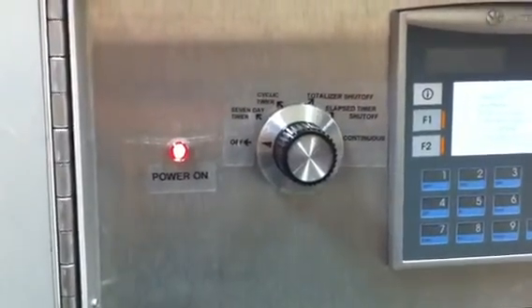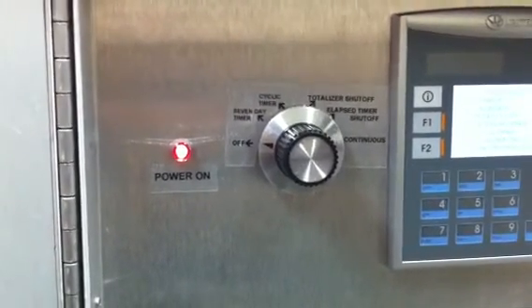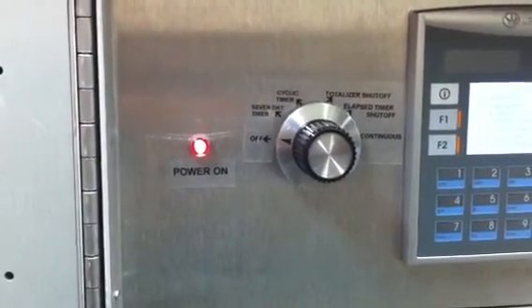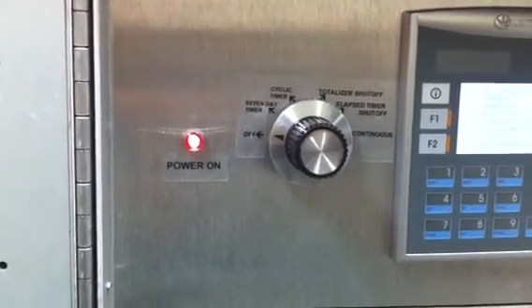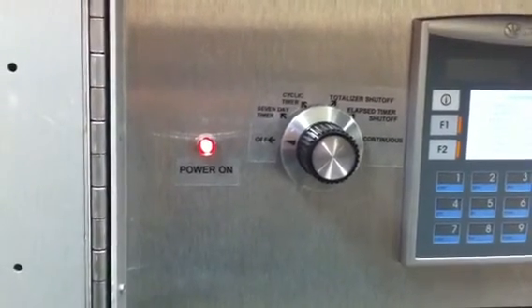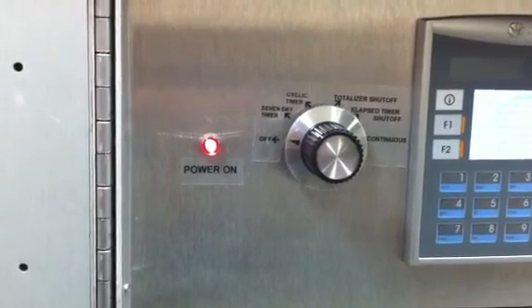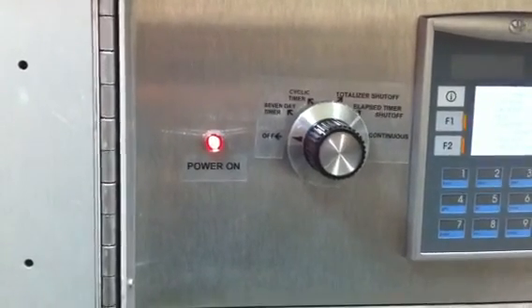These modes include: the 7-day timer mode, where you can turn the unit on and off during different times of the day and days of the week; a cyclic timer, where you set a schedule and have it repeat after so many days; a totalizer shutoff, where it shuts off after sampling a total volume; an elapsed timer shutoff, where it samples for a set time and then shuts off; and a continuous mode, where it keeps running continuously.